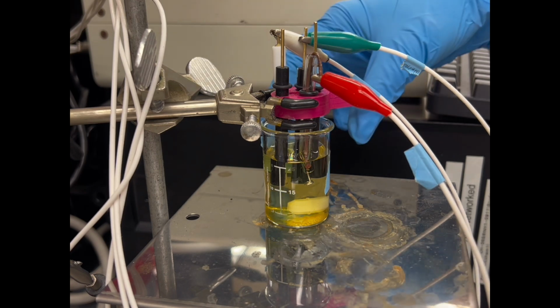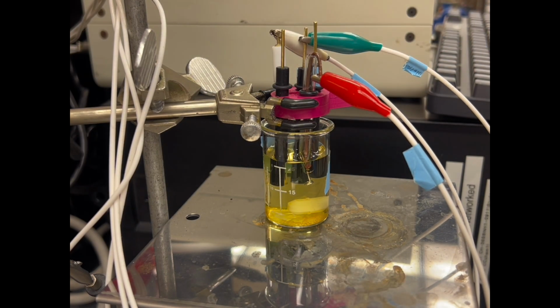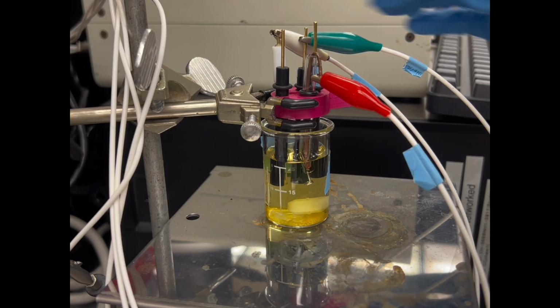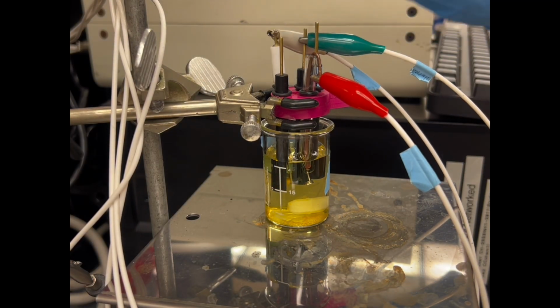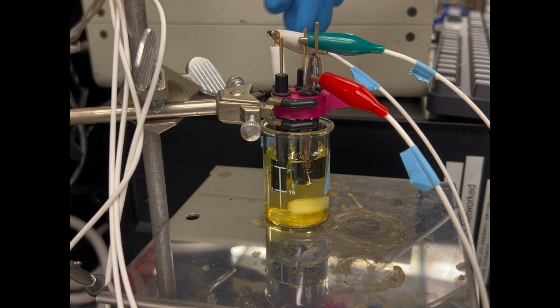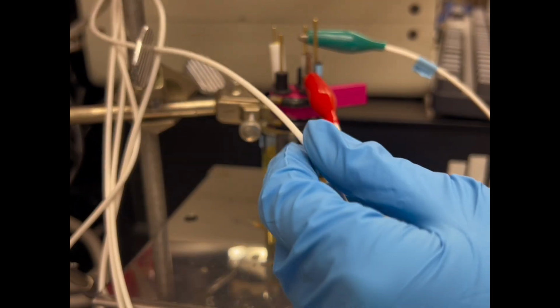This time it's in the 25 ml beaker, so it is actually easier to adjust the electrode because there's more space for them. But we will also make sure they're not touching each other, not touching the edge or bottom, and they connect well.